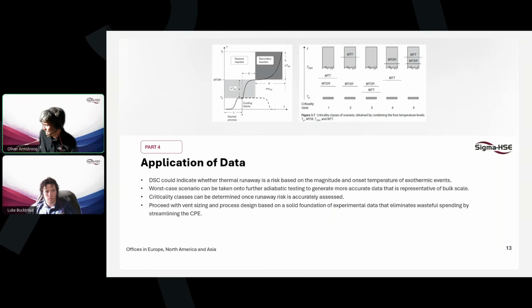Okay, yeah, I mean, we really love using our DSC. Love talking about how adaptable it is for certain scenarios, but the small sample size requirement for DSC testing, that is a benefit for those early stage studies, can come with inherent limitations, such as the difficulty in preparing representative samples of heterogeneous mixtures, potential heat losses during test analysis, and some difficulties in scaling to bulk systems or the use of large safety factors.